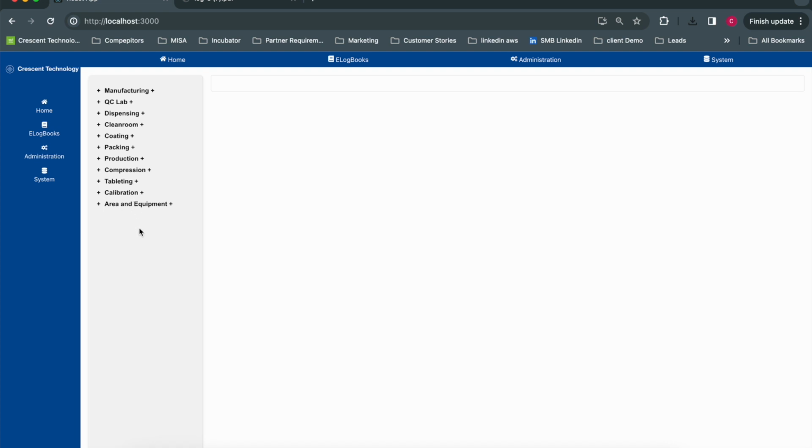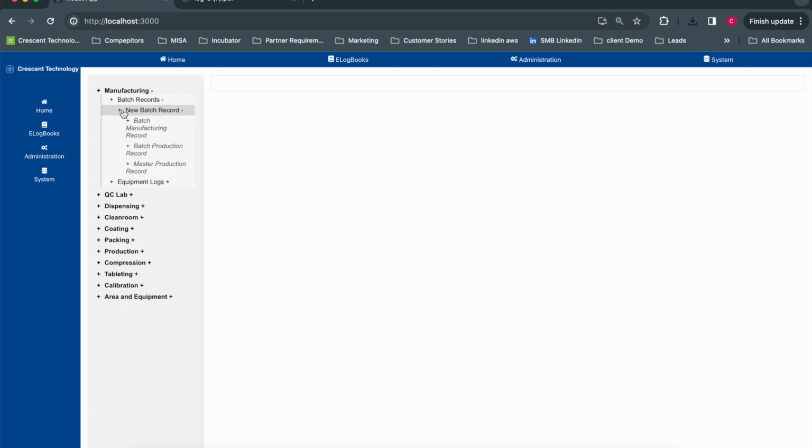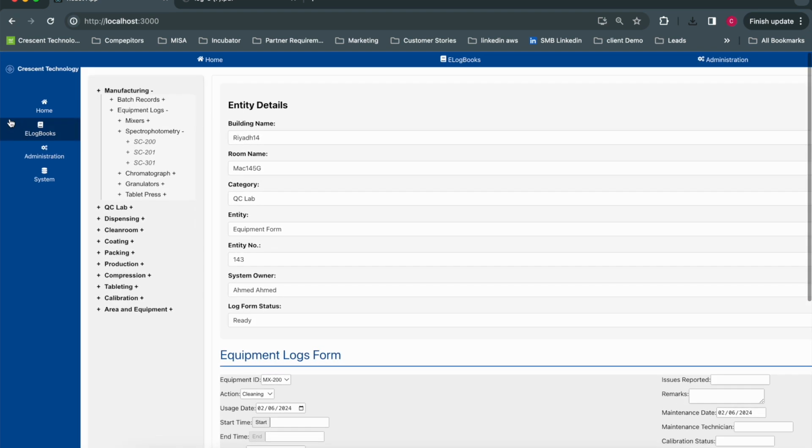Since this is a software as a service, we're going to constantly release updates, even to the fact that let's say you can take a picture of a paper logbook and it automatically translates into these columns here. Like it can automatically translate into the stuff here. You see that? So it'll automatically translate there.